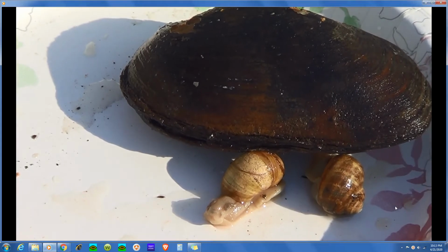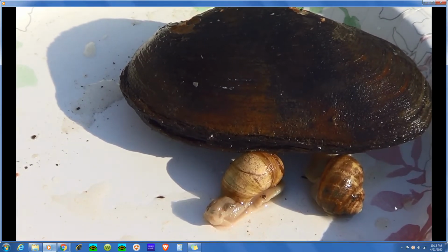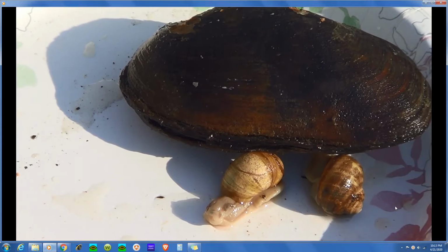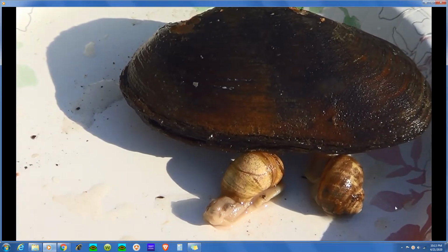Now, there are some kinds of squid that do have a shell, called nautilus. I don't have any nautilus to show you. Back at school in the display case, I've got some fossilized nautilus shells, and I've got some actual nautilus shells, but they're not available to me right now, so I'm not going to be able to do that. And so you got your visceral mass and your mantle. The mantle secretes the shell, and the mantle covers the mantle cavity where the gills are located.